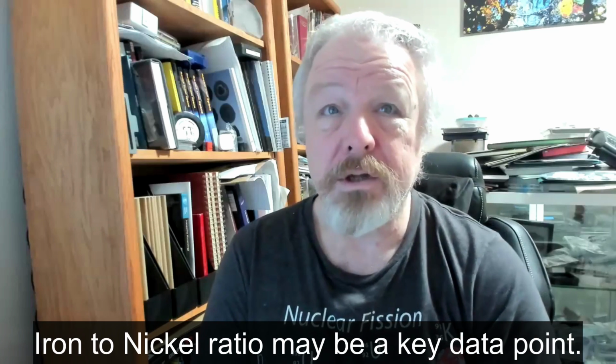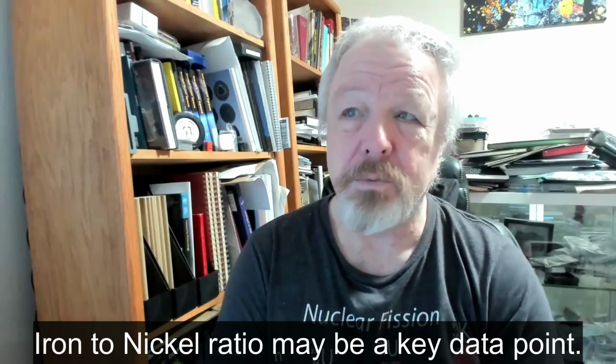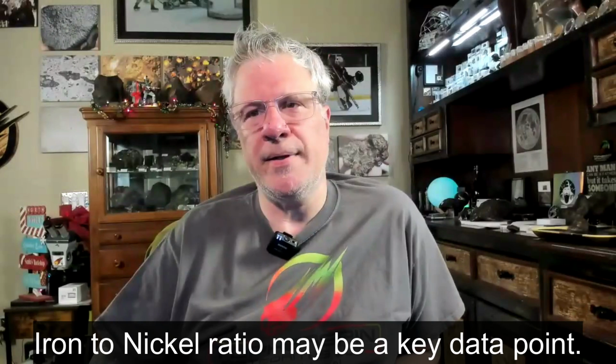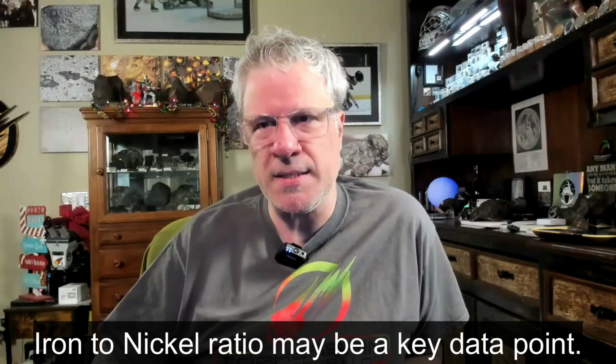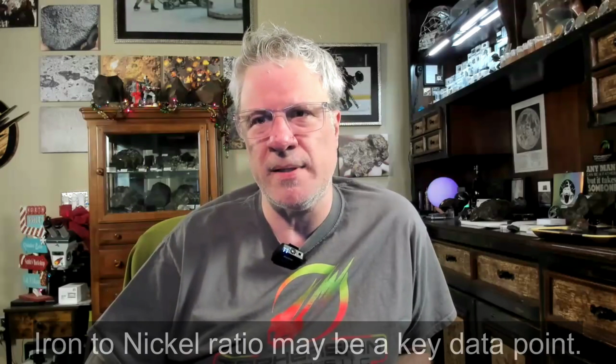One other thing, Michael, that we've been kind of using and kind of shooting from the hip on Meteorite or MeteorWRONG and the other identification pages is looking at the iron to nickel ratio. That's the most common one that I use when I'm attempting to interpret results. I agree with that because those are two elements that I at least can recognize on these results, and they're two that are important for meteoritics. So, Mike, what kind of ratio would you be looking for? Could you add any comments on that?